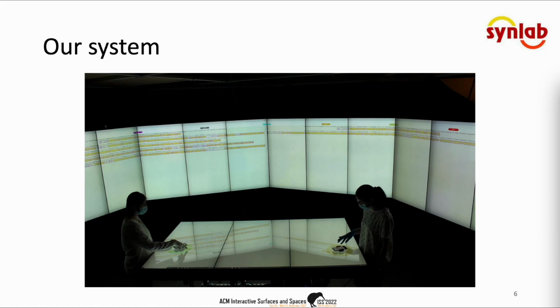These were decided on as a group by our interdisciplinary team, then implemented by the HCI researchers and tested by the biologists in an ongoing manner. We met on a weekly basis to assess progress, make design decisions, and determine next steps.